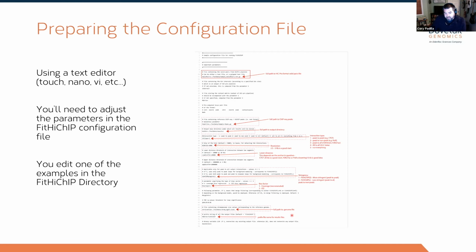And so finally, the last thing that we want to do here is flag our .genome file. This is just a text file of chromosome lengths, so it can build the bins, and then a prefix that you want to call everything. So now that we've gone through and edited the config file, now we just run.